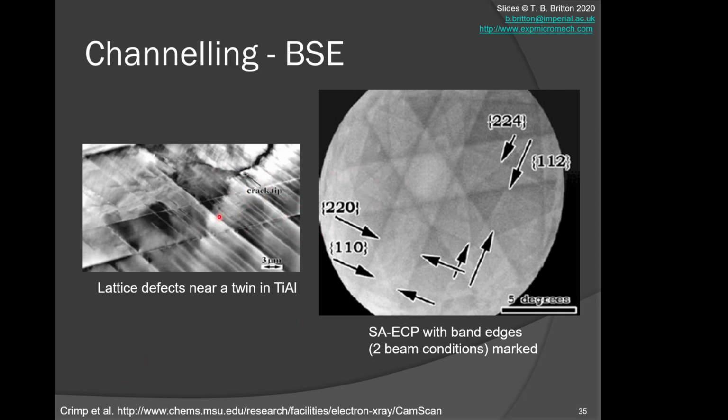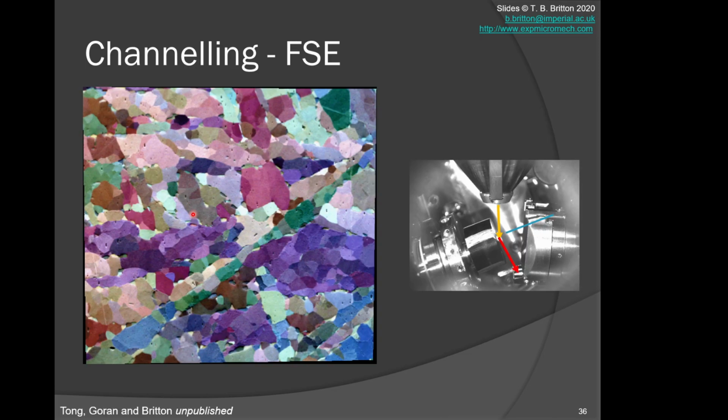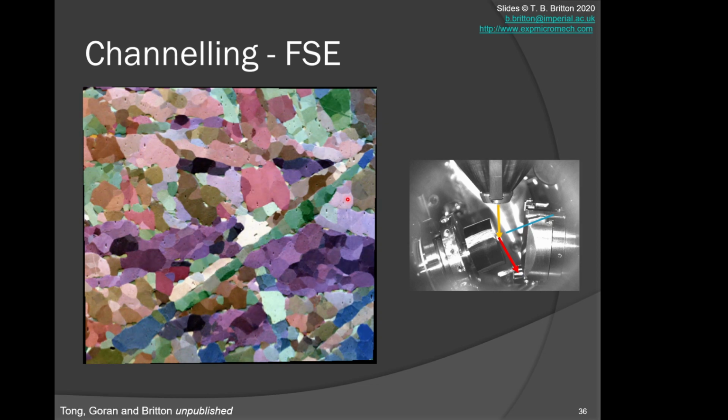It's not impossible to do on a microscope. So the research group I'm leading, we're trying to do some of this in anger, but often you'll get this by accident. If you just look at a sample carefully on a single crystal, you can reveal things like dislocations without too much effort in the SEM. This is a really nice example to show where this works in more anger.